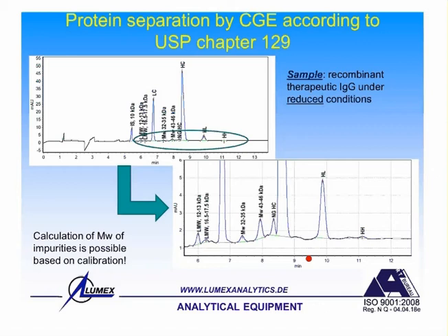You see, the whole analysis is finished within, let's say, 11, 12 minutes, as I mentioned. But despite the short time, we get a very nice separation of all the components which were inside our protein sample. So this is very short about CGE and also the protein analysis.